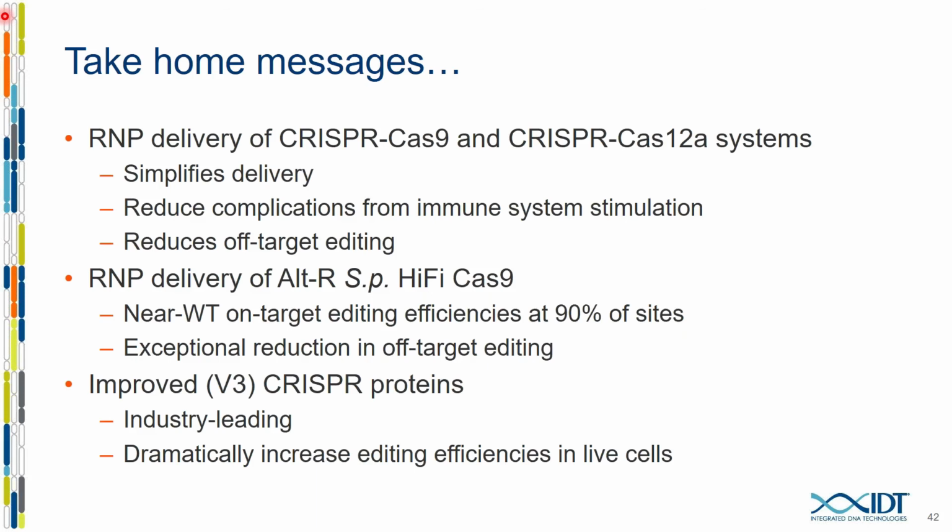Another question that has come in is if the V3 proteins still require using the Alt-R electroporation enhancers. Yeah, that's a really great question. I think there are still a handful of sites, especially with Cas12a, where the overall editing is low and you still see a pretty significant jump with the enhancer. So for Cas12a specifically, the answer is yes. It's still something that should be put into practice. It's certainly not going to hurt.